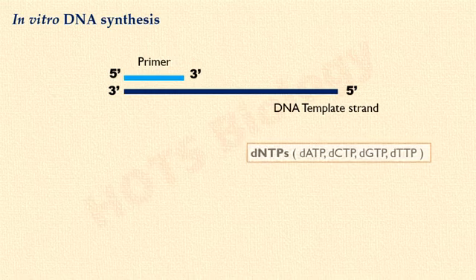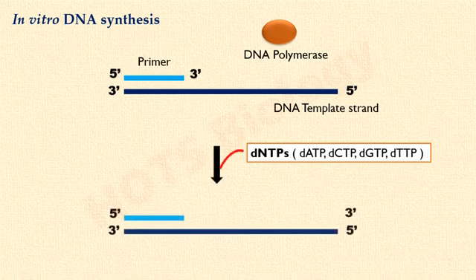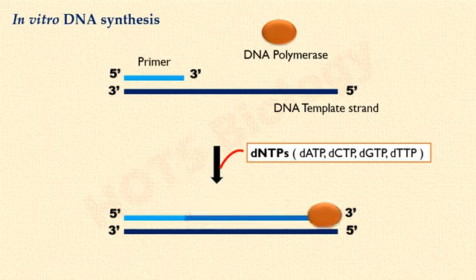We will also require deoxynucleotides. To catalyze the DNA synthesis reaction we require DNA polymerase. DNA polymerase incorporates deoxynucleotides complementary to the template strand and extends the DNA chain in 5' to 3' direction.